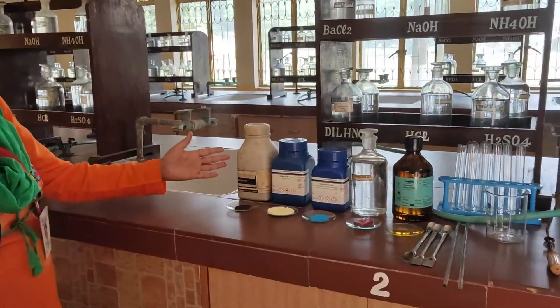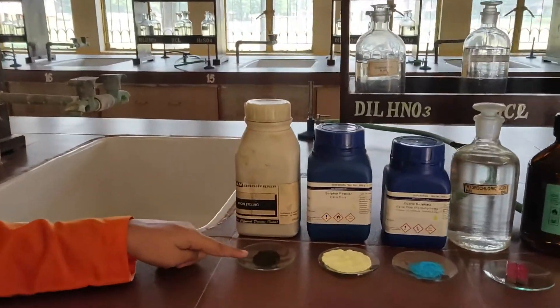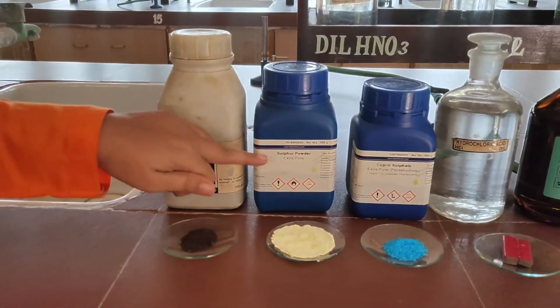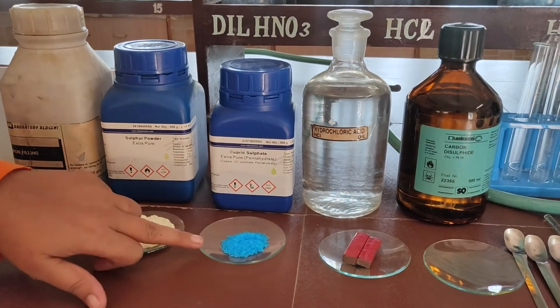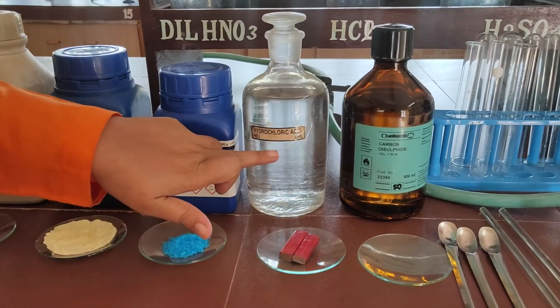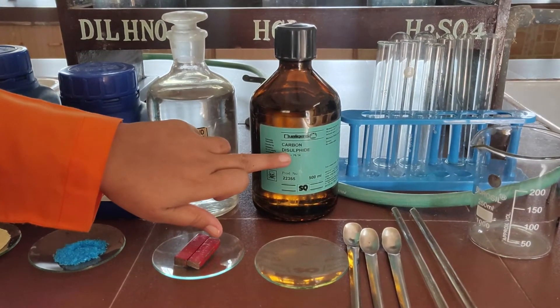Now let us see what chemicals and apparatus are required for our practical. First is iron filings. Next is sulfur powder. Then comes copper sulfate. This is dilute HCl, that is hydrochloric acid. Then carbon disulfide.